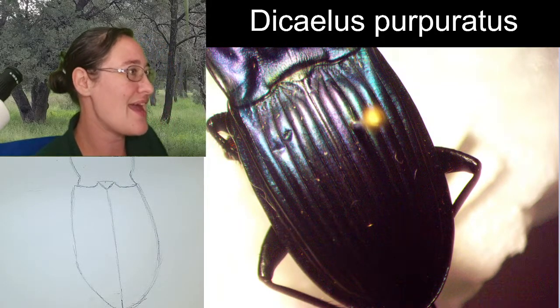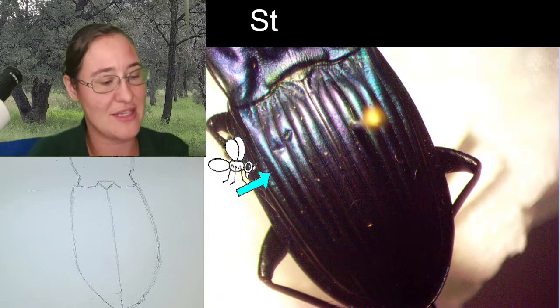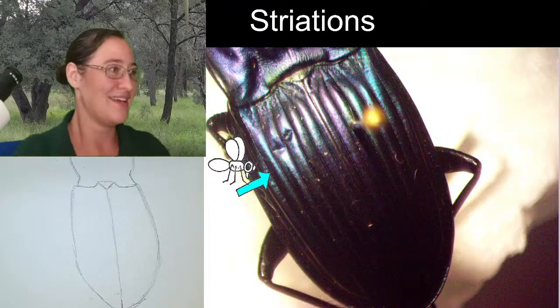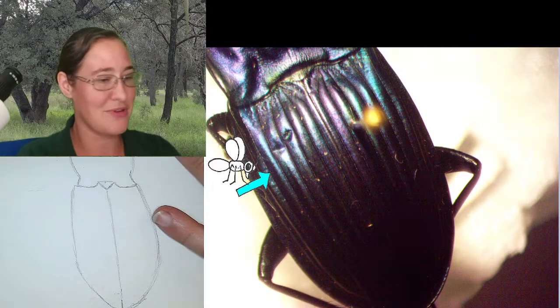These lines in the elytra, these here, the scientific name for those types of lines in the elytra are called striations. Alright, so those are little striations in the elytra. And I'm actually pretty happy.